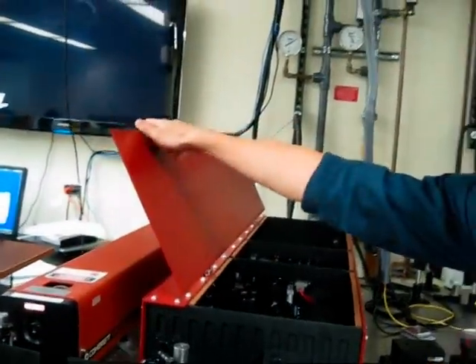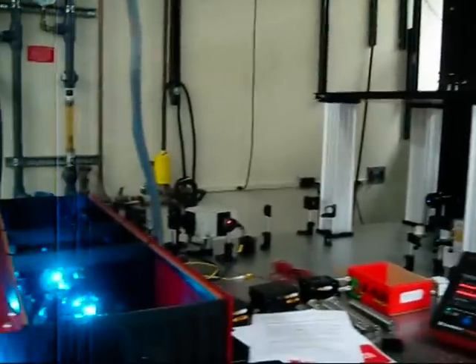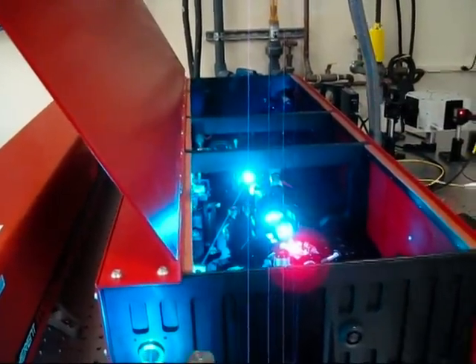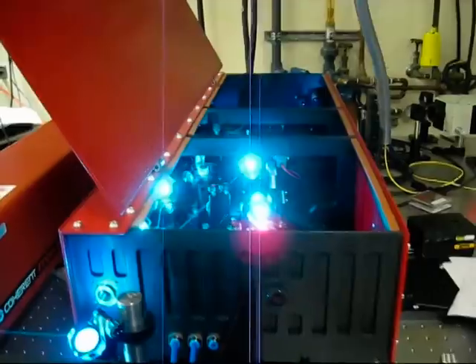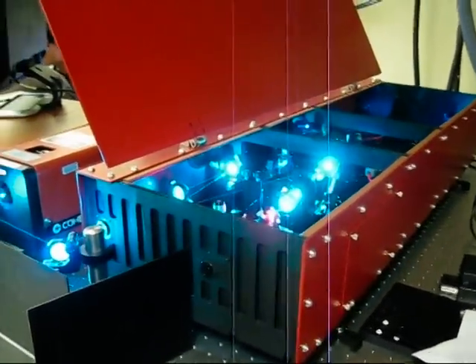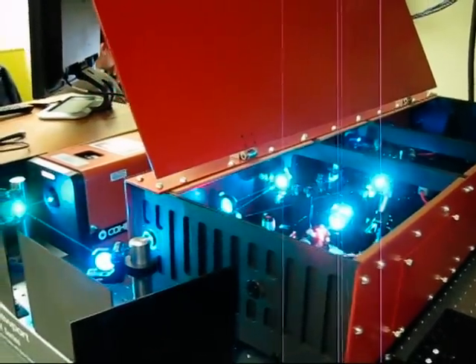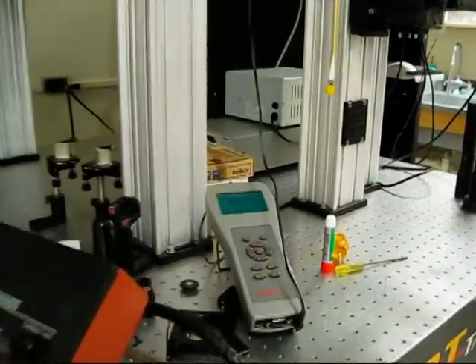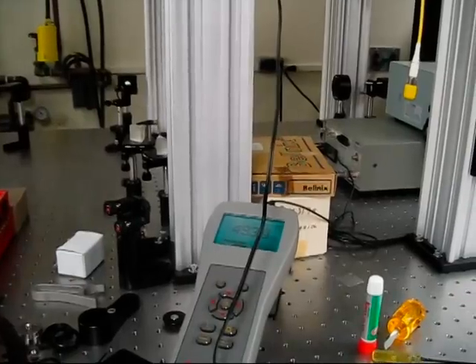Daniel is going to turn on the spectrometer. It looks like the light turned green, so alignment is very stable over months, as long as it's aligned once every month or so. The cavity doesn't have to be aligned at all — the only alignment issue is the pump laser. And we get an output of around... what is your pump power now? My power is around probably six or seven watts.